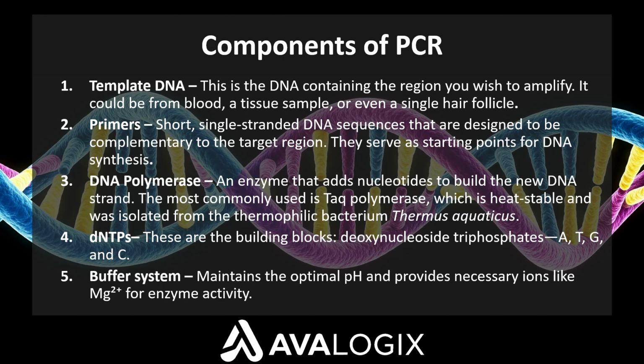Then we have dNTPs, or deoxynucleotide triphosphates. These are the building blocks of DNA: adenine A, guanine G, cytosine C, and thymine T. They are incorporated into the growing DNA strand during the extension phase.